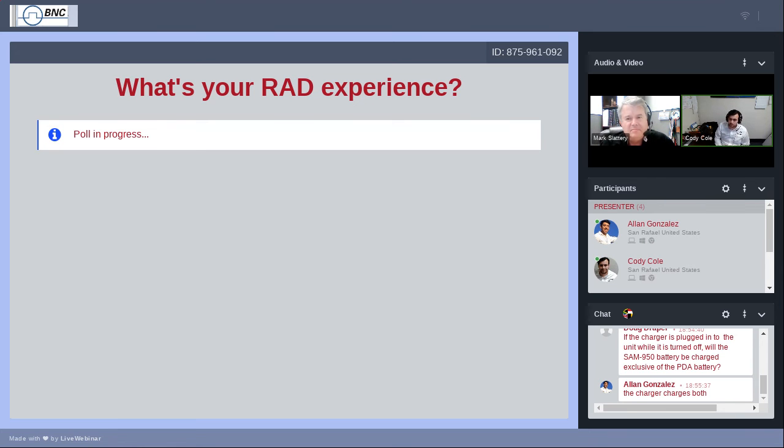One question I actually want to ask you, Mark, that came up when we were discussing the presentation was about what you should do when you're trying to power up the SAM 950 in a location that is already filled with a radioactive element. Okay, this is fair.